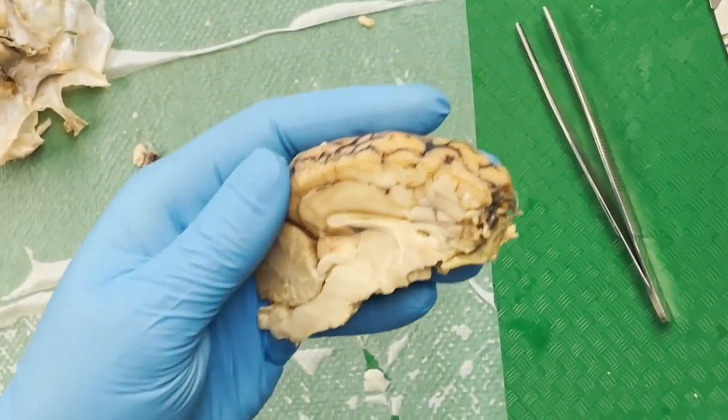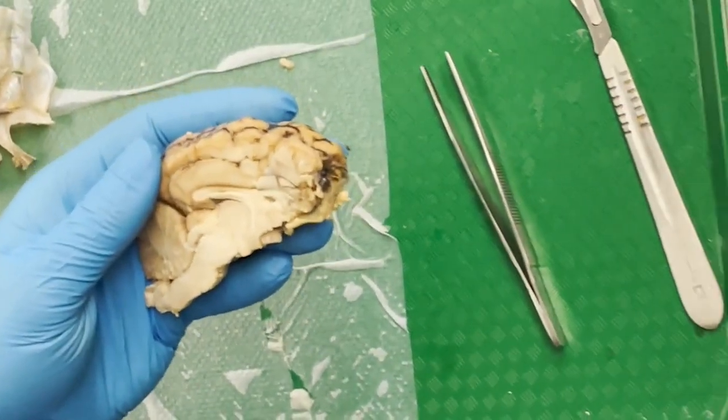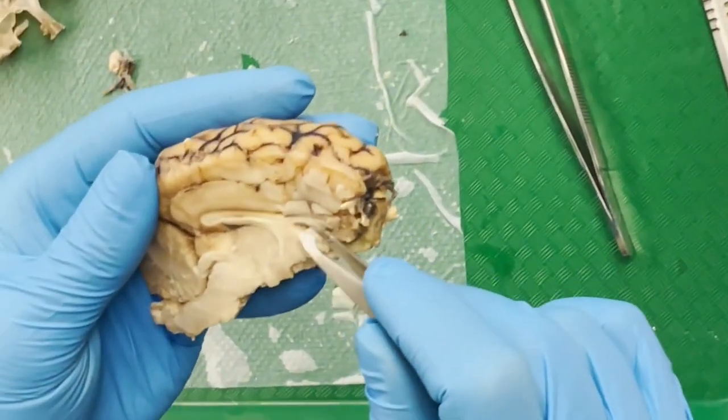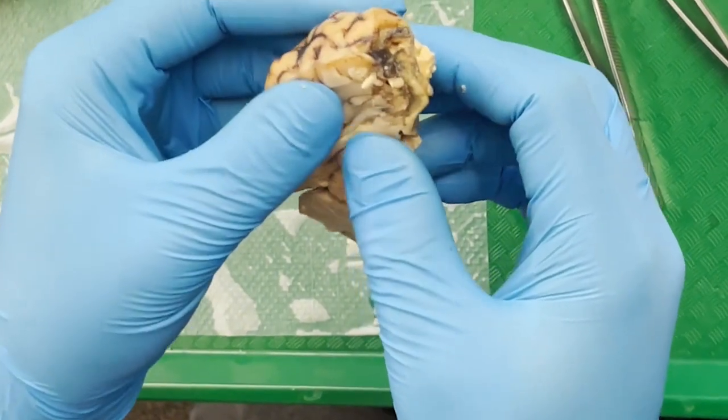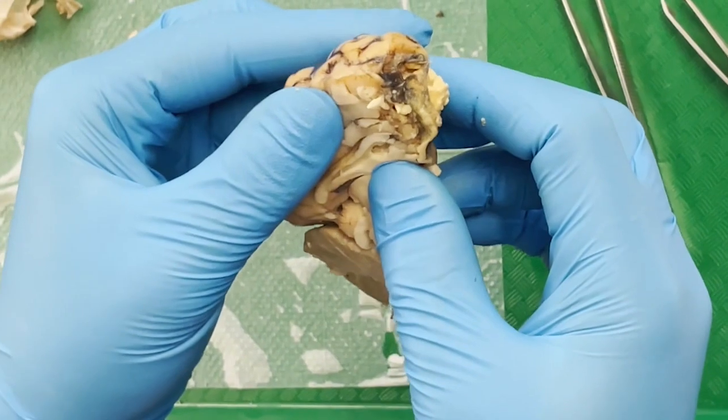What else do we have? Oh yeah, the septum pellucidum. Pellucidum. That would be about here, but I think in this case it is already opened up.